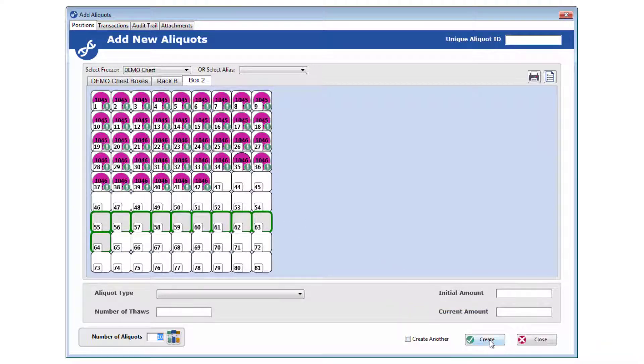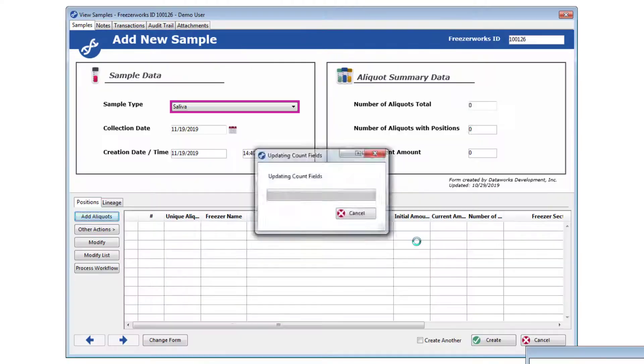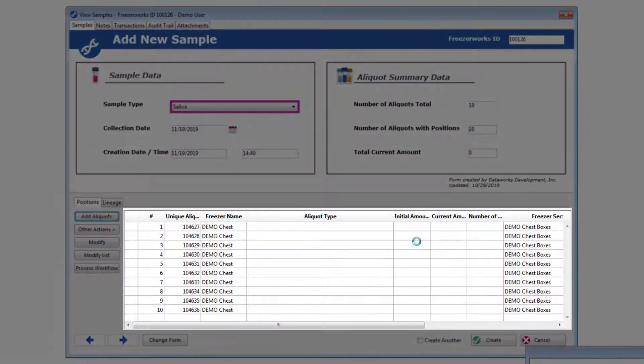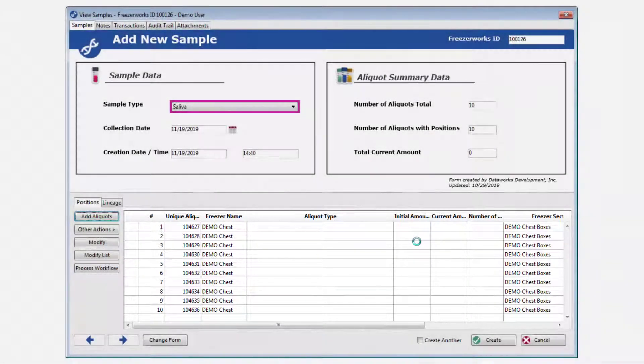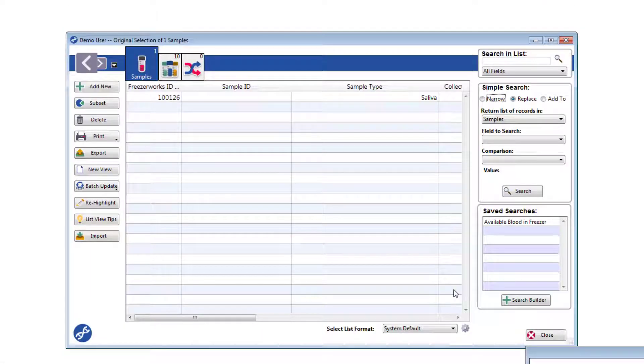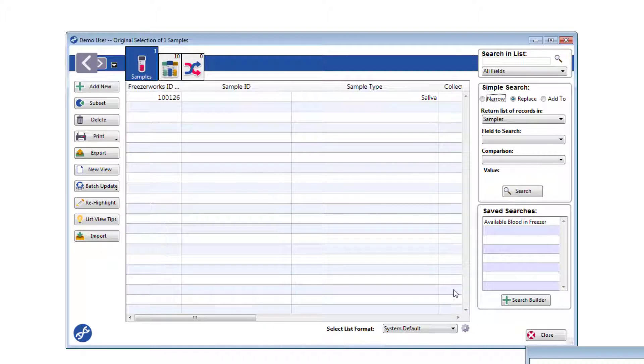When you return to the samples entry form, your aliquots are now in the Aliquots Area List box. Click Create, and you'll find yourself on the Inventory List view with the sample just created listed.